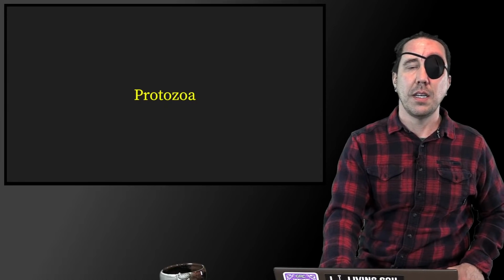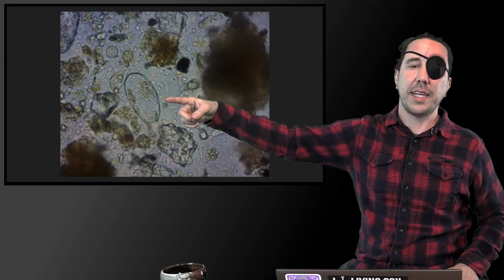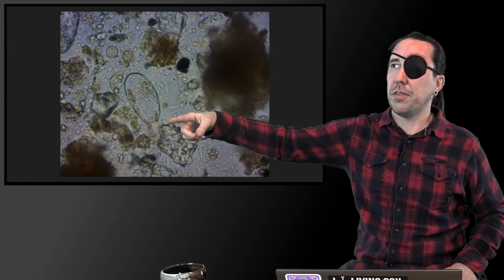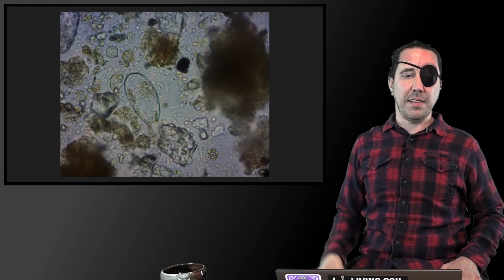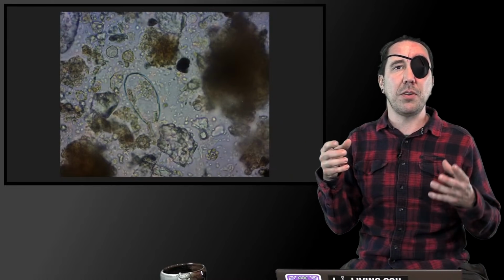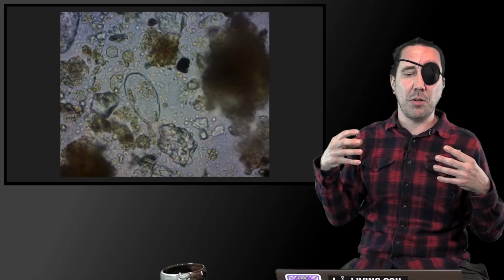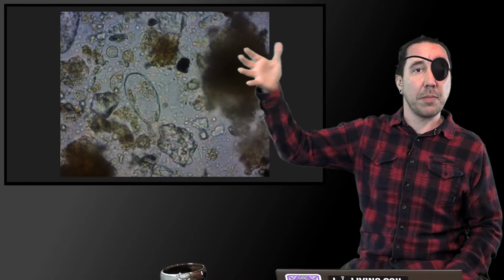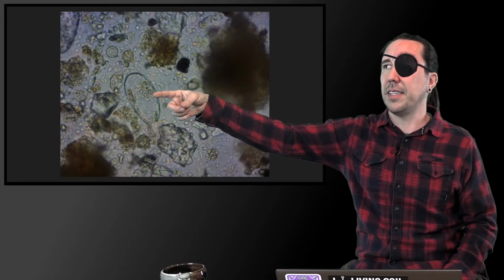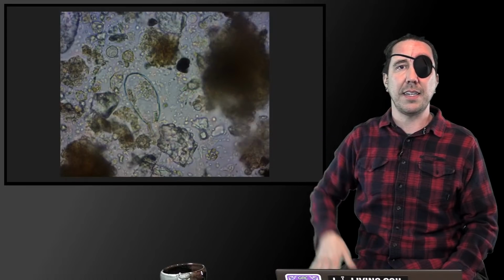And then protozoa. This right here is a testate amoeba. I like to say it looks like an olive shape. You've got the oval. Right down here is the mouth section. And that is a test, or a shell, that the amoeba goes into. Generally, when I'm looking at a sample, from shaking the sample or moving it around, they will draw themselves back into their shell, but there's a body in the shell that can sometimes come out or will come out of the shell to feed and eat on bacteria. And you can see inside there's bacteria. Some of it's behind the testate amoeba, but some of it is in the testate amoeba. That's bacteria that the amoeba has eaten.